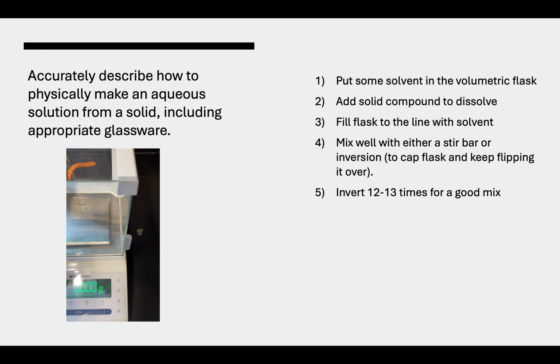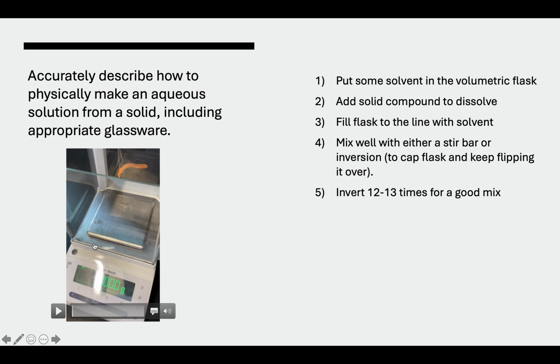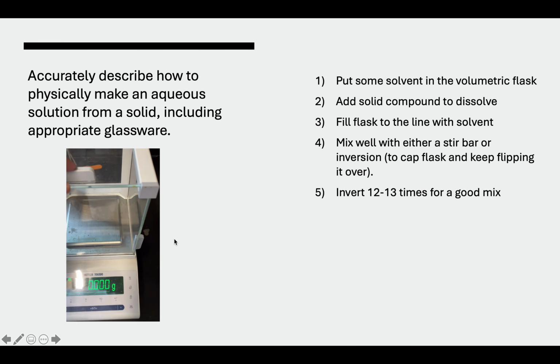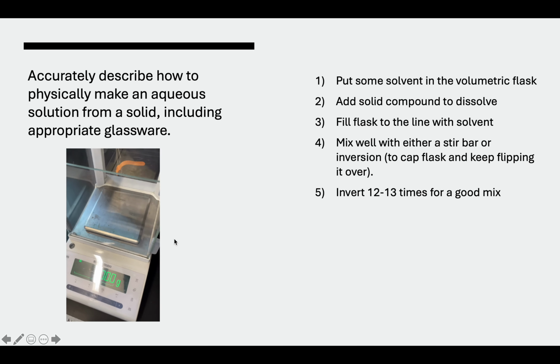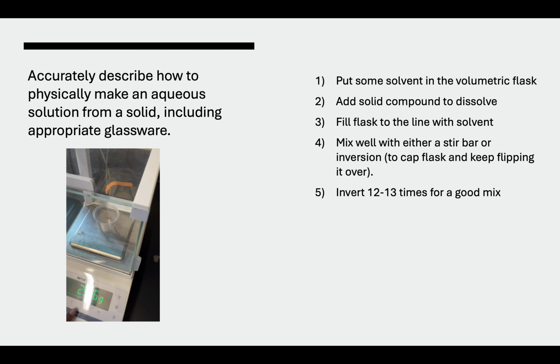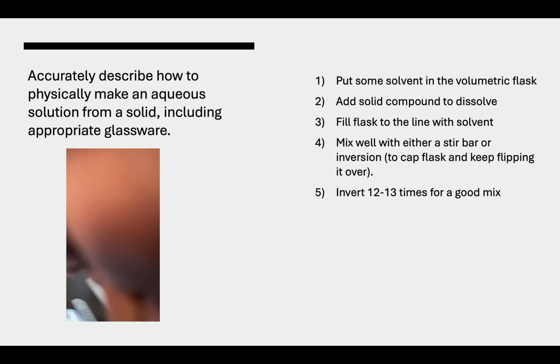Before I started measuring, I zeroed the scale before I added the cup in, and then I zeroed it after I added the cup in as well, after I closed the lid. So now I can start weighing my sugar.